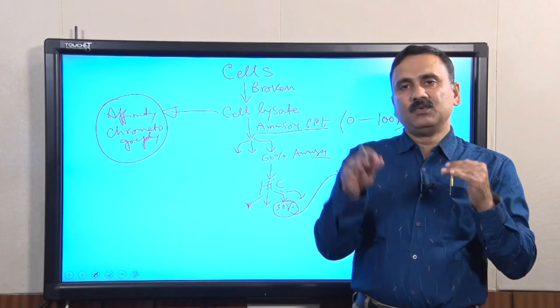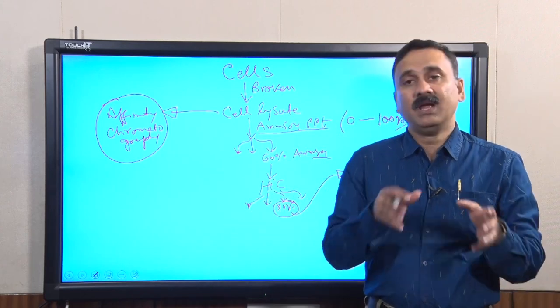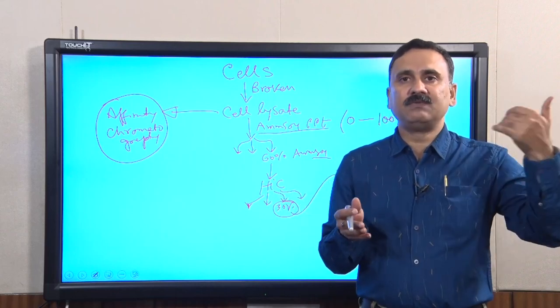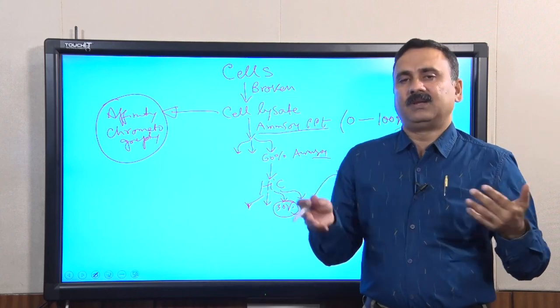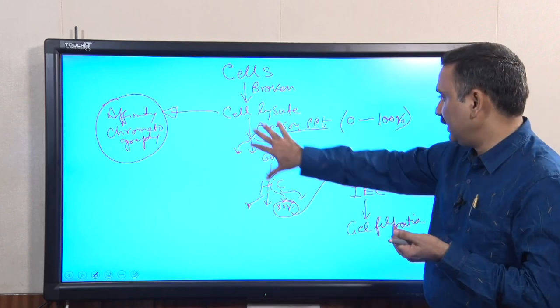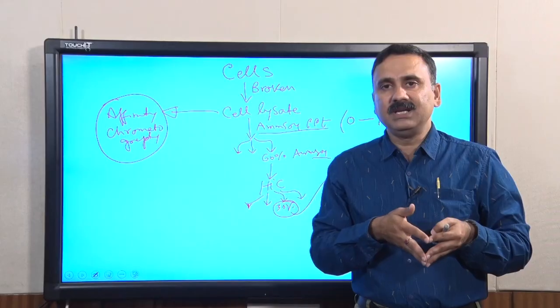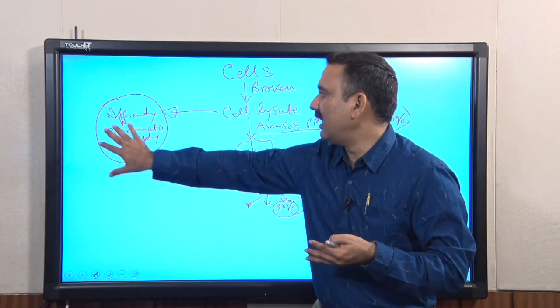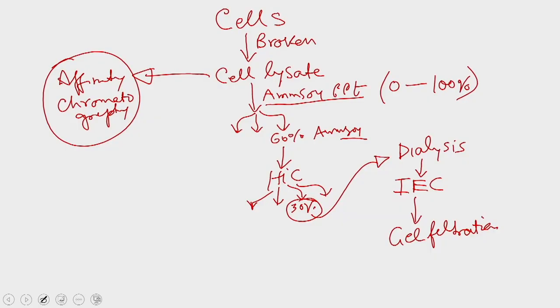So I keep using the combination of hydrophobic interaction chromatography, ion exchange chromatography, and gel filtration chromatography, and within the ion exchange chromatography, I have the option of using anion exchange or cation exchange chromatography. Using all these combinations, probably you will be able to get the purified protein. If you follow this type of scheme, definitely there will be more losses of your protein, which means the recovery as well as the yield is going to be low. Compared to that, if you have the affinity tag, then you can directly use the affinity chromatography, and that's it. In a single step, you may get more than 90% purified protein.